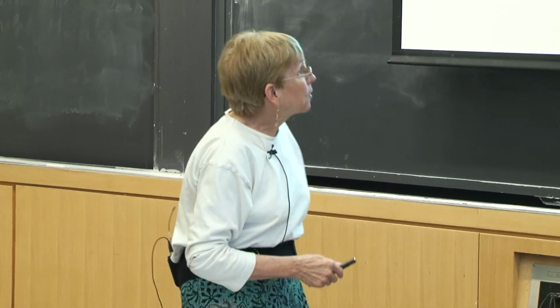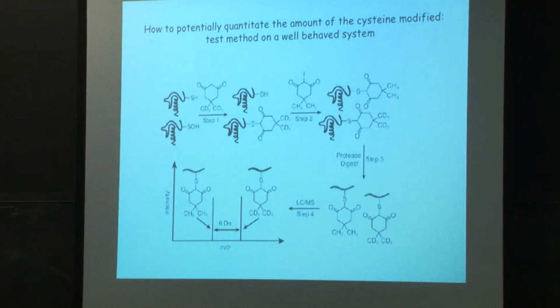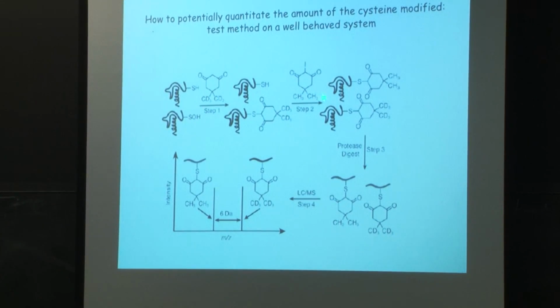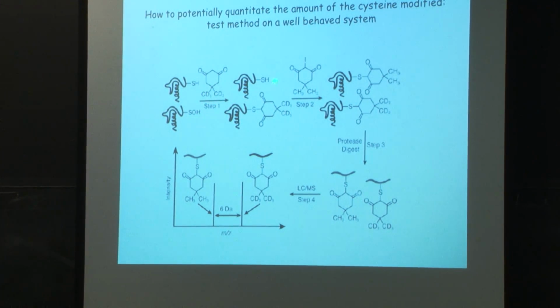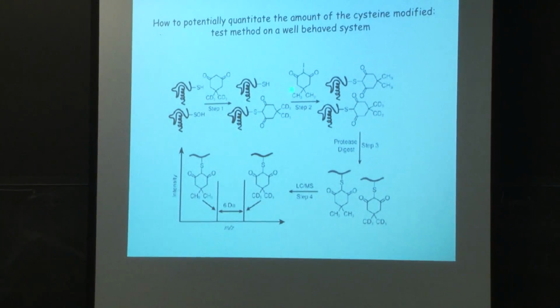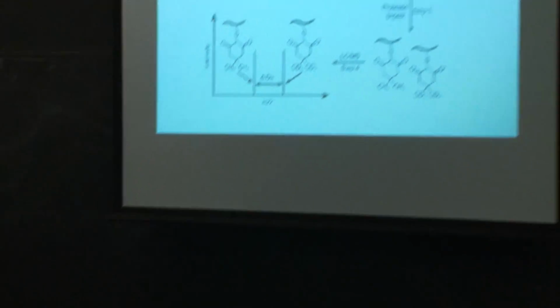And so the mass spec method we had focused on last time, which is also used again in this paper, but if you didn't read the supplementary information, you won't know that, is they use isotopically labeled materials. This is only if you have an extra mass of 6, you have the deuterated methyl groups, and that means you have a sulfenic acid that you've modified, because she's shown that it's specific versus the methylated, which reacts with thiols only. So that's the basis of the assay.